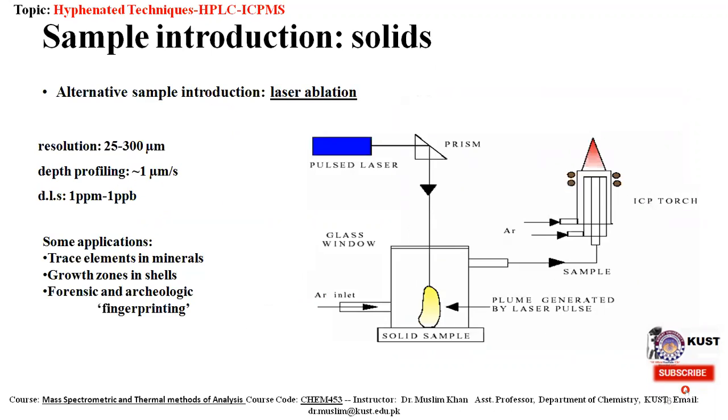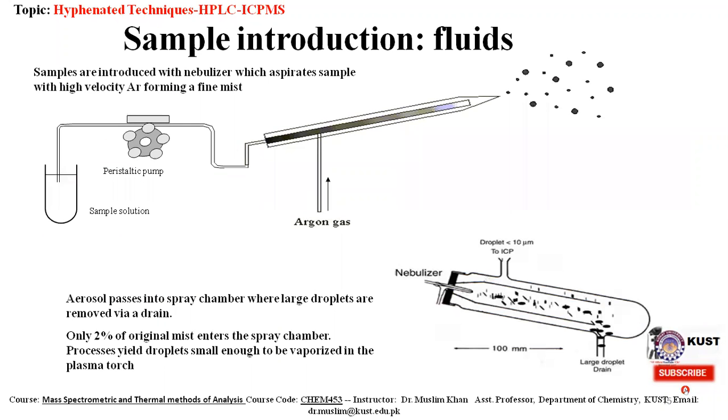In a previous slide, I showed you this nebulizer. It emerges as an aerosol, which eventually finds its way via the sample injector into the base of the plasma.